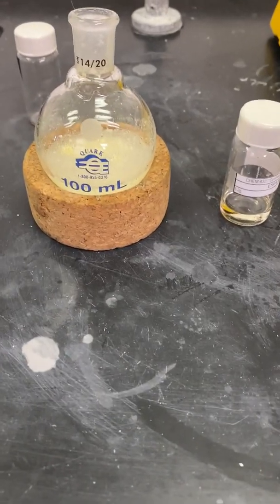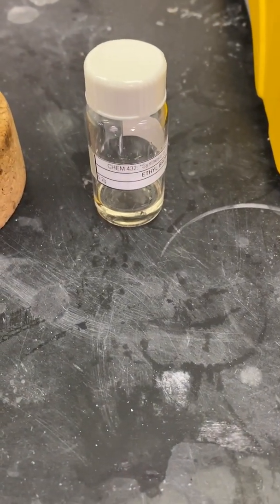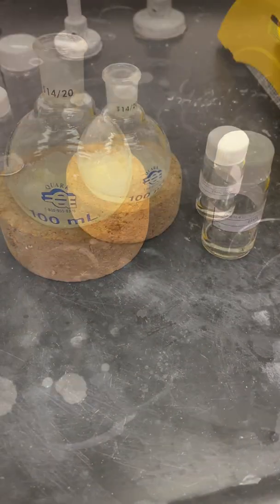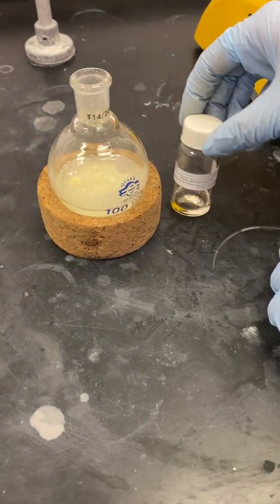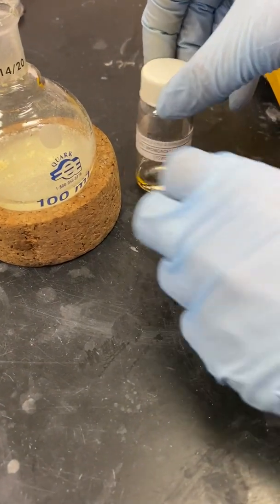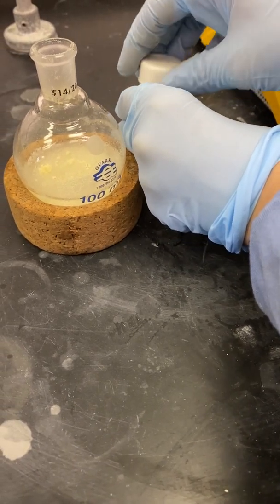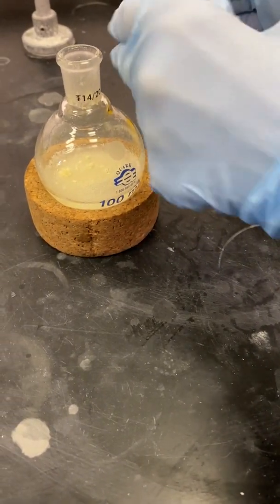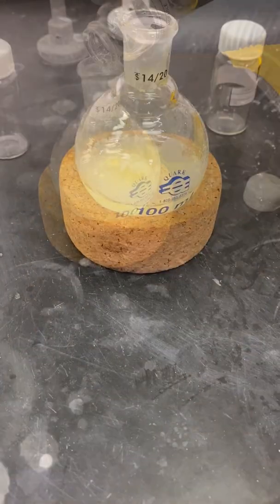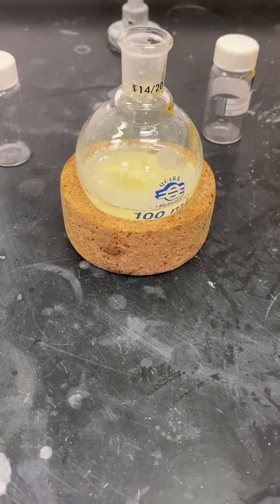I will now proceed to add in my ethyl bromoacetate into my round bottom flask. This has already been pre-measured out for you, so there's no need to measure it out. Please remember that ethyl bromoacetate is a toxic lacrimator — this means it can really make your eyes water and burn. When you are adding this in, please add it in carefully and efficiently. Once you are done adding it in, please cap the vial and put it in your fume hood.